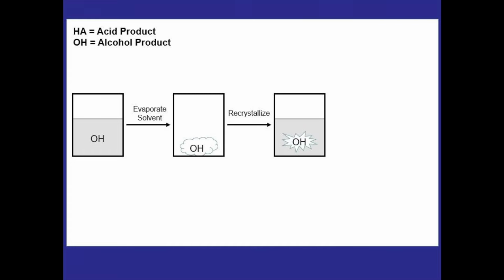The problem here is that we don't know which alcohol we have, and therefore we don't know which solvent would be best to use in the recrystallization process. In the past, we've used ligroin, we've also used ethanol and water, and we could even use an ethanol-water mixture if either ethanol or water doesn't work out too well. In the Cannizzaro lab, ligroin was used as the solvent to recrystallize the alcohol product, so generally that's a safer choice in recrystallizing the unknown alcohols.